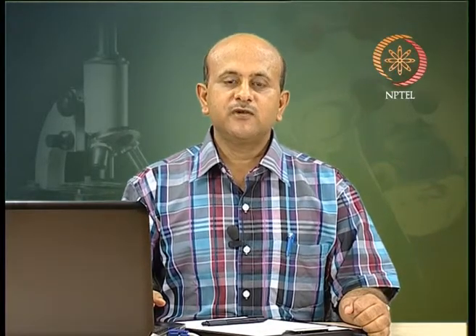All right. So, in this lecture we have discussed two methods, and we will continue our discussion in the next lecture about the formation and different aspects of the density gradient. One is differential centrifugation and the other is gradient centrifugation.